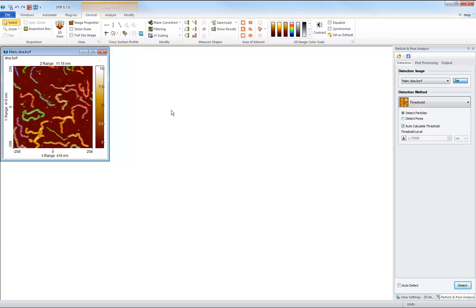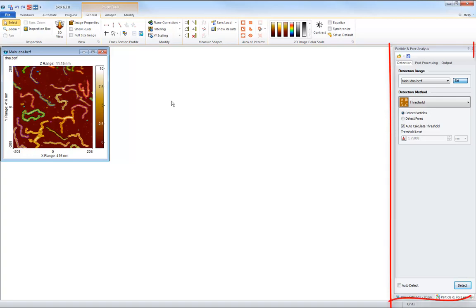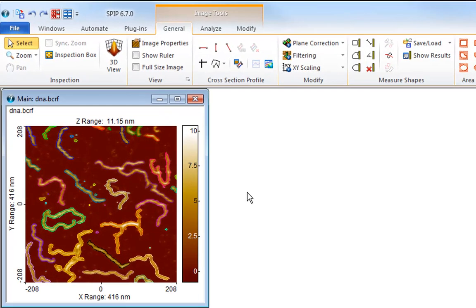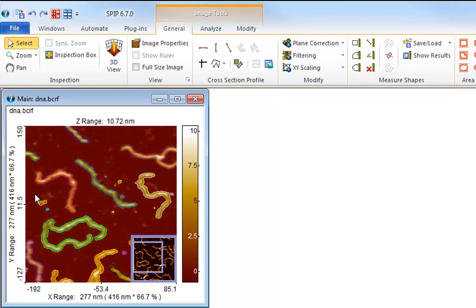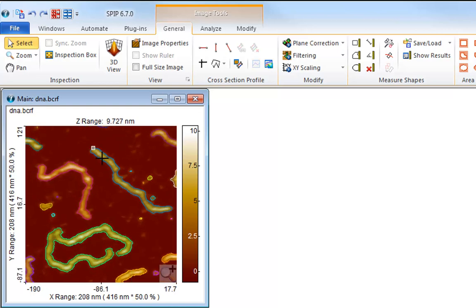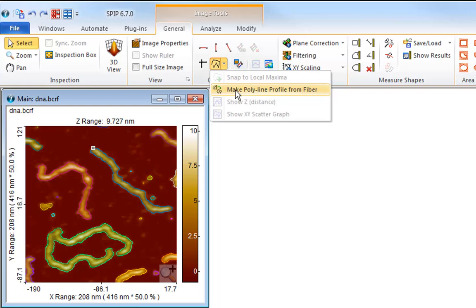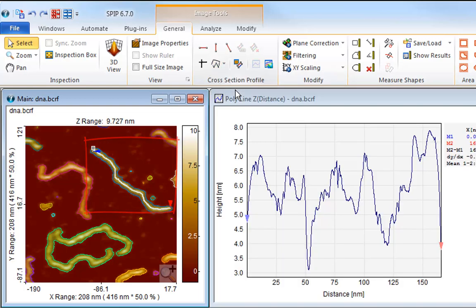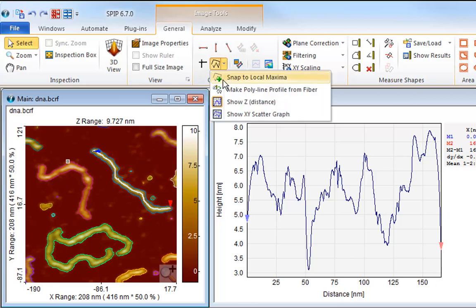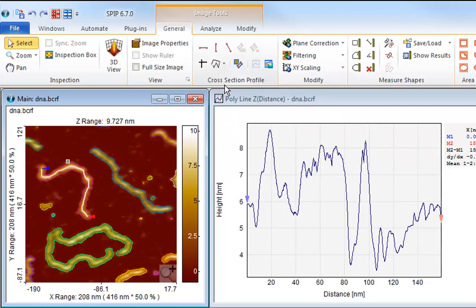When the objects in the image can be detected by the particle and pore analysis feature in SPIP, this is easy. In this example we have performed a particle detection. Now select one of the strings. In the drop-down menu on the polyline button you will see an option called Make Polyline from Fiber. Click this option and SPIP will create a polyline profile along the centerline of the string. Select another worm and repeat the procedure. Distances can now be measured using cursors.